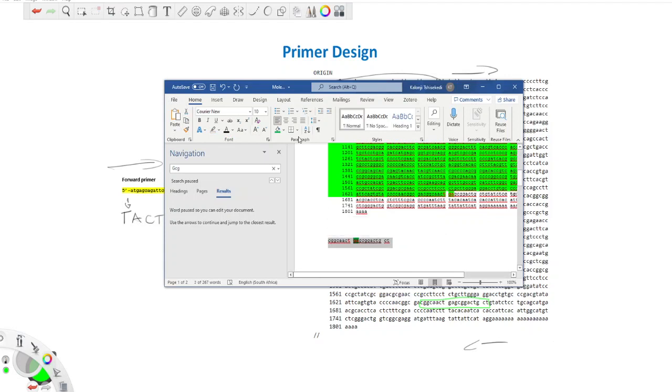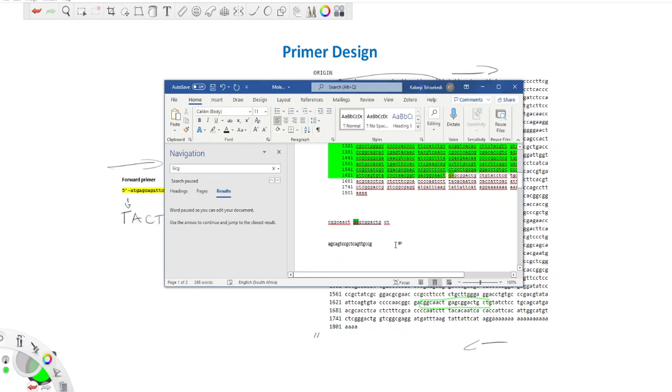Once I have it, I just want to remove all the different colors and all that. I'm going to select the region again, and I'm going to work out the reverse complementary of it, and I will explain what has been done with that reverse complementary region. To make things quicker, I'm just using a tool, and we have the reverse, and we've also flipped it.